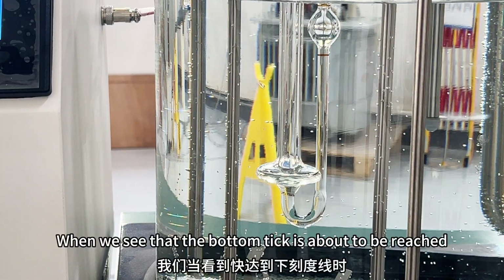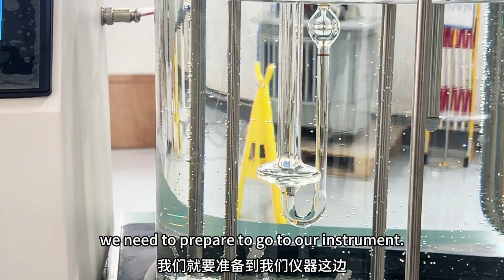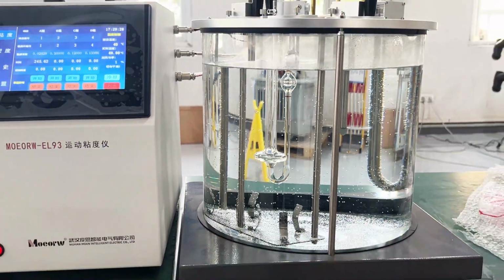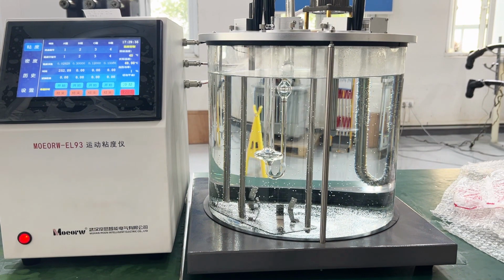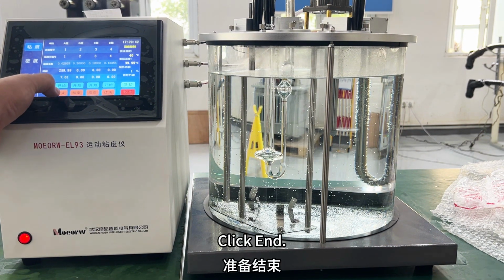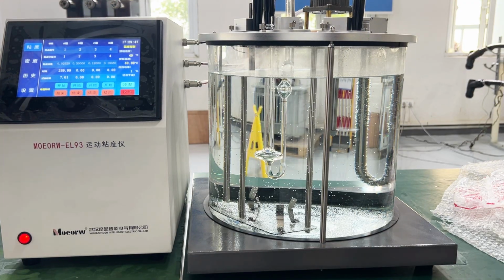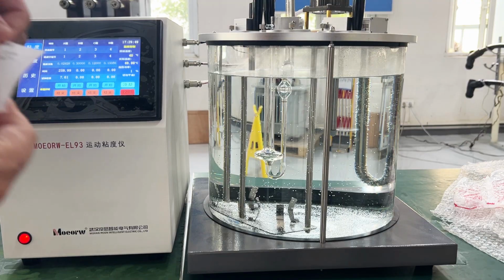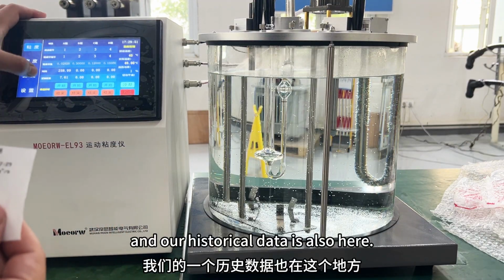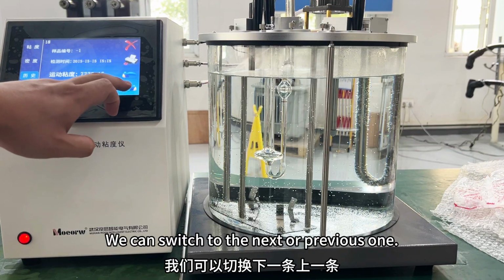Okay, when we see that the bottom tick is about to be reached, we need to prepare to go to our instrument. Click to end. Okay, it's arrived now. Click end. Here is the test value, in this printout. Then, our historical data is also here. We can switch to the next or previous one.